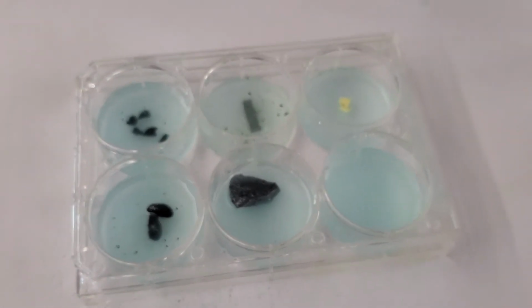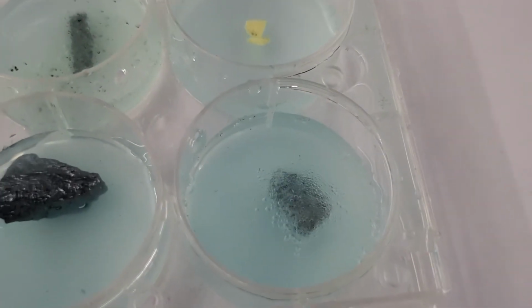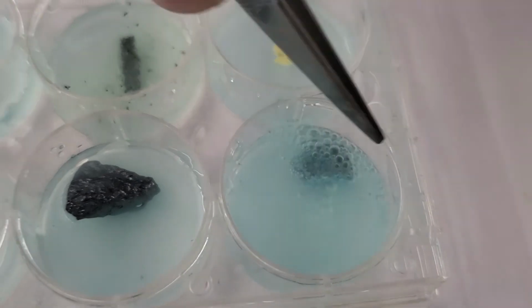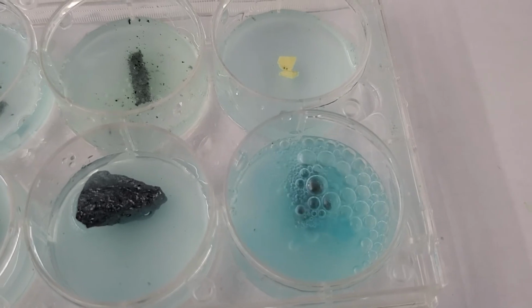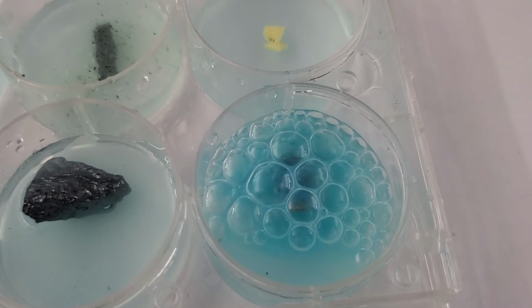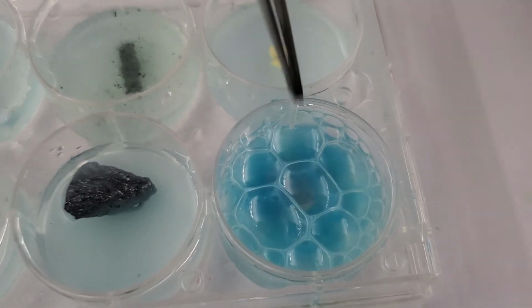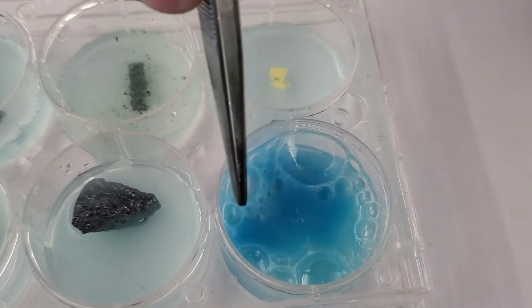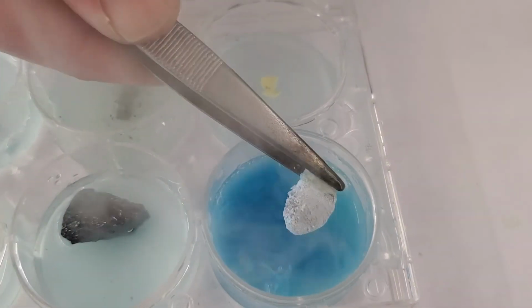And lastly is calcium. Now you can see it's immediately starting to bubble quite rapidly. And it's actually changing the color of the liquid. If you look at the color of the liquid, it was kind of light blue, and now it's turning to a darker aqua blue. It's even gotten prettier blue than it was before. And you can see the piece, it looks now white.